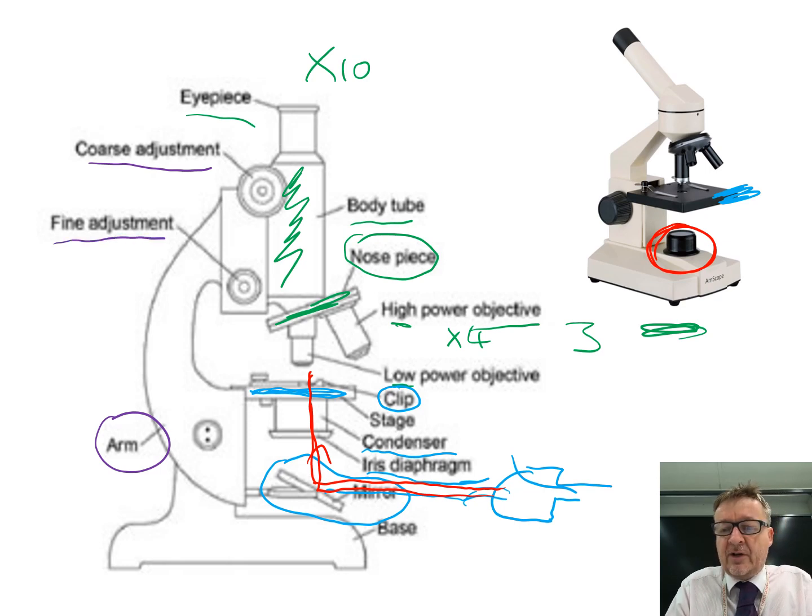Those two knobs are for focusing. You start with the coarse adjustment to get it approximately in focus, then go to the fine adjustment to get it absolutely focused to your own eyesight.